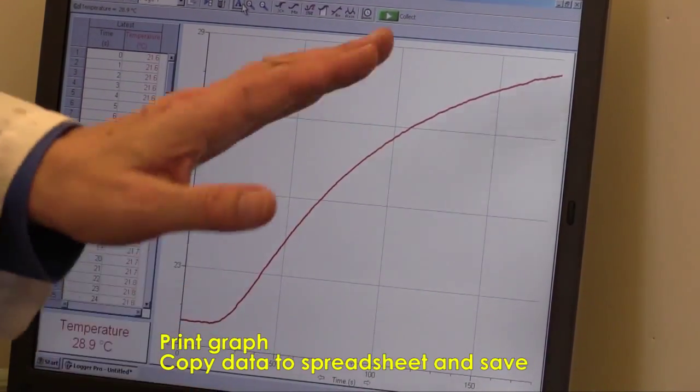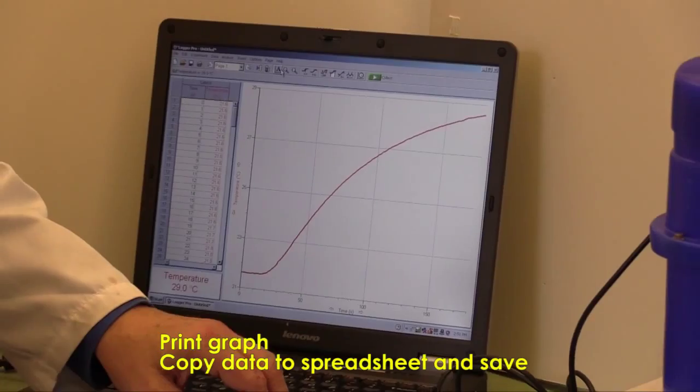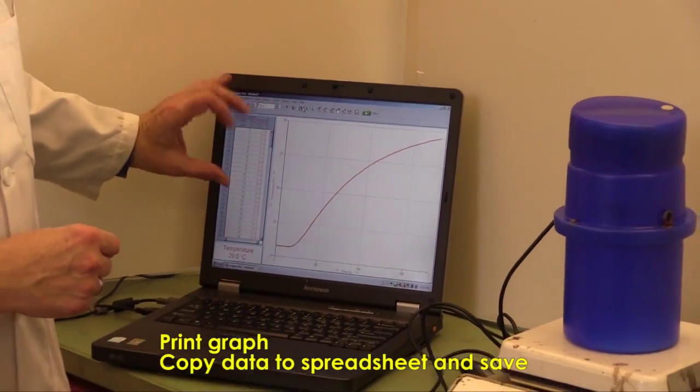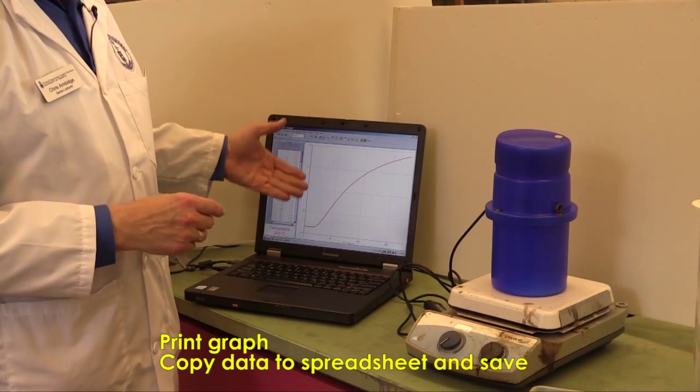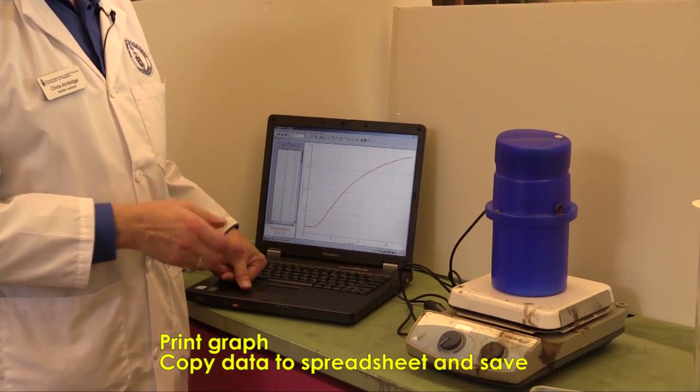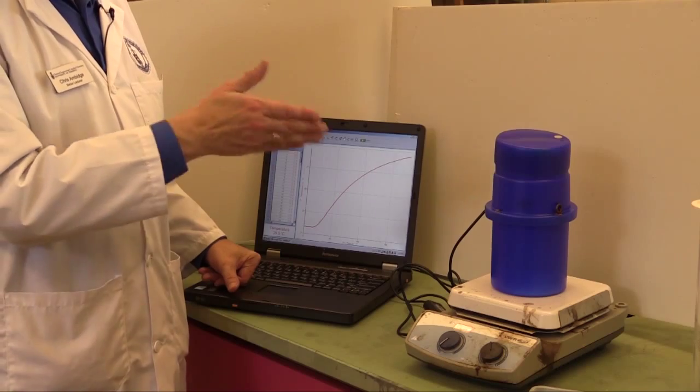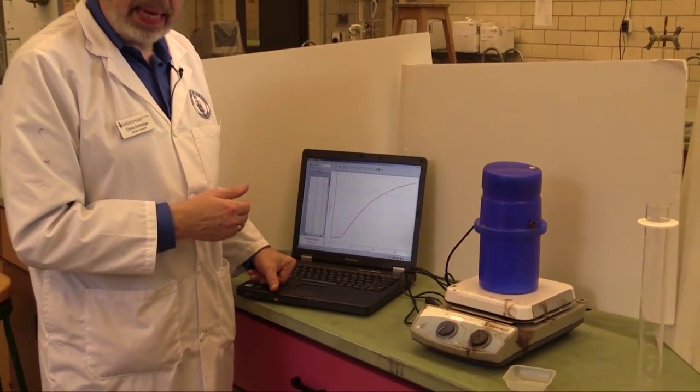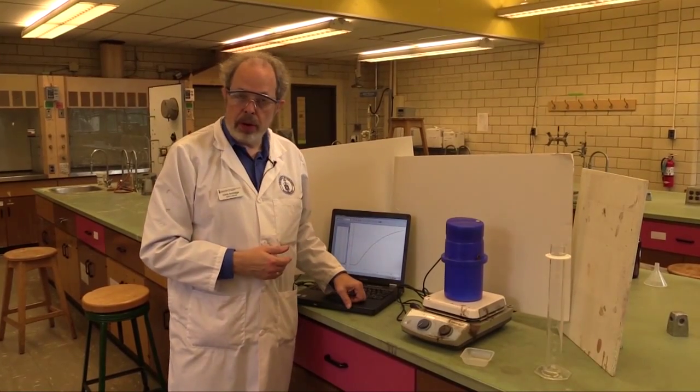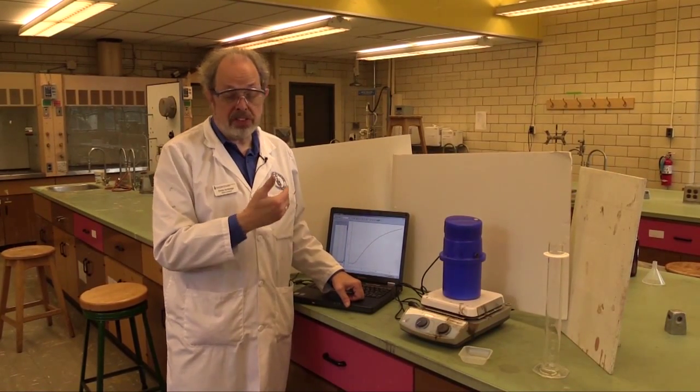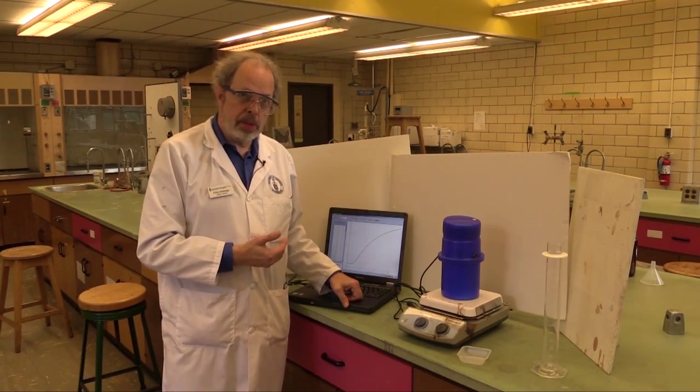At this point, what you do is send this graph to the printer and then highlight all of the data. Control-C to copy it and drop it into a spreadsheet program. And then later on, copy it onto your USB key. And that is how you collect data for a magnesium and acid or solid and acid calorimetry run.